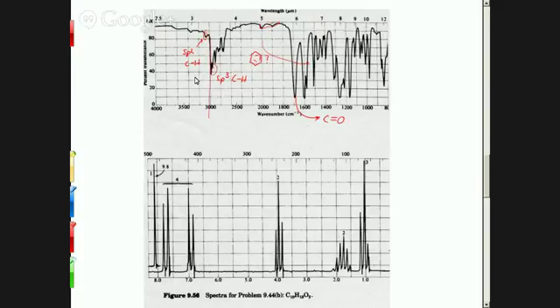So the only thing between like 6.5 and 8.5, or 6 and 8, is this ArH. And when we see Ar, that stands for aromatic. That tells us those benzene rings. So our suspicion from that IR is correct. The NMR confirms that there is absolutely a benzene ring here. But because this is NMR, we get more information about that benzene ring.